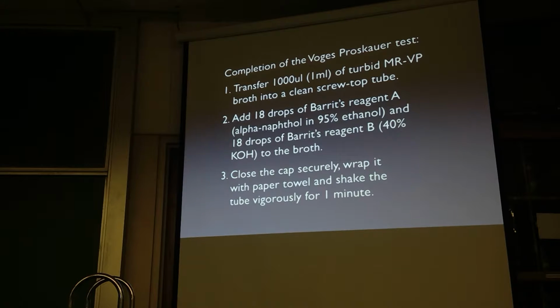So this is a vortex mixer. This thing is supposed to be set at the maximum vibration, and if you put it on, it just vibrates. So instead, we put it on automatic, then it will only vibrate when you touch it. Anyway, you have to turn it on. It's going to vibrate pretty good.